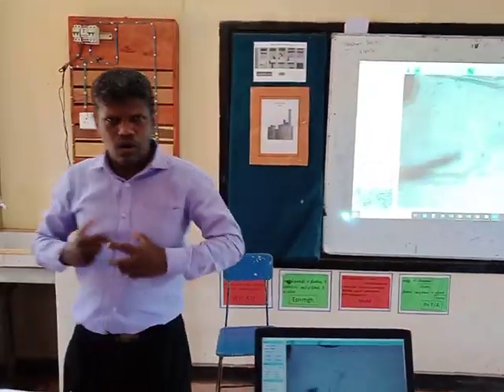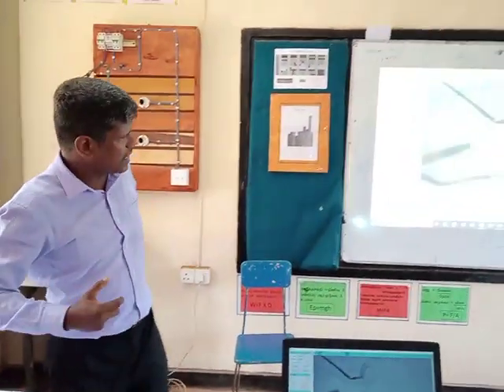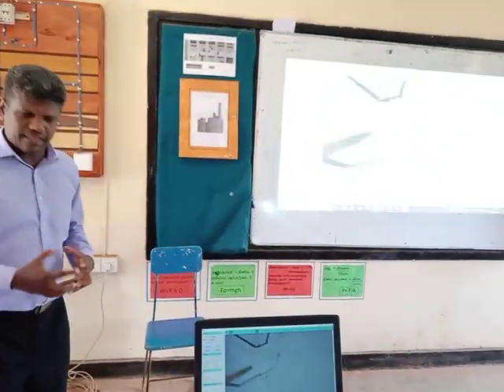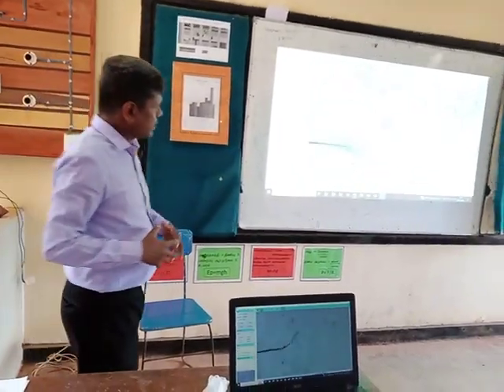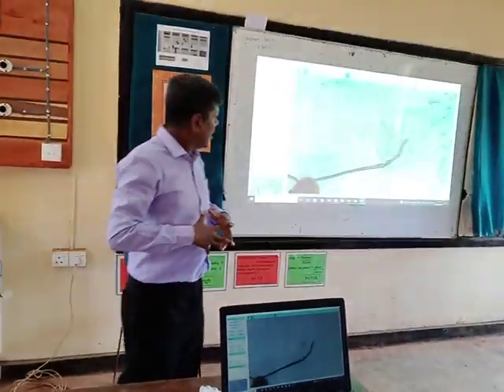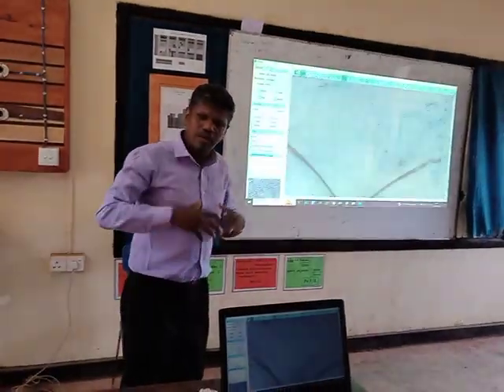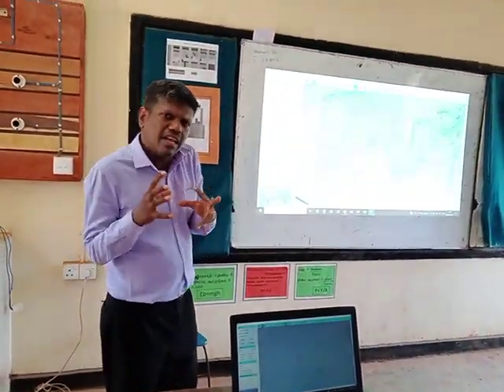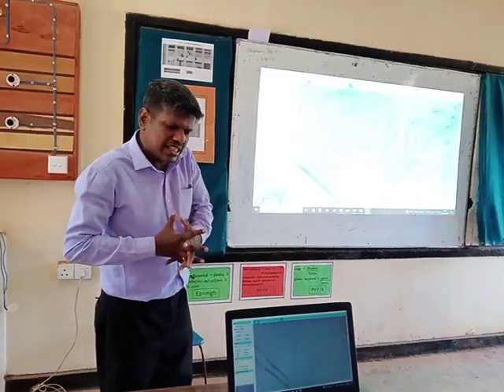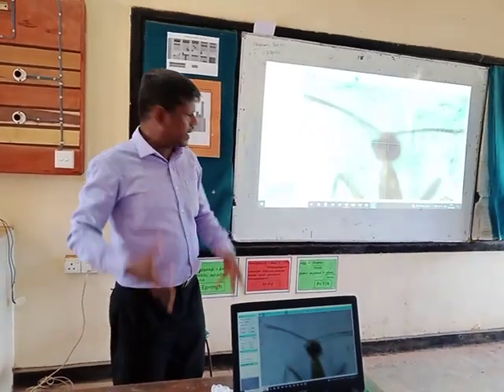Hello, my name is Kalki — the organization. They donated this device to us. All the kids are jubilant while they are using this hands-on experience.